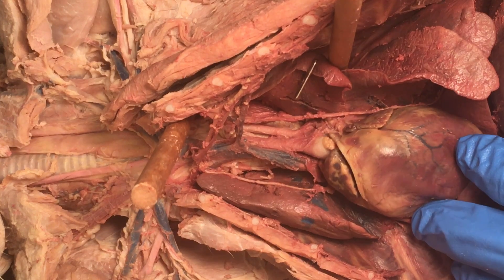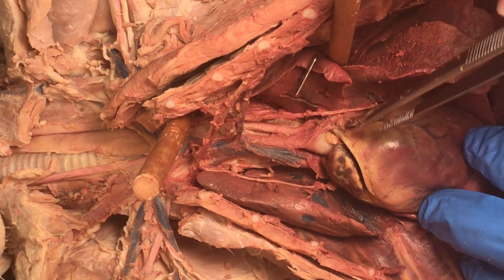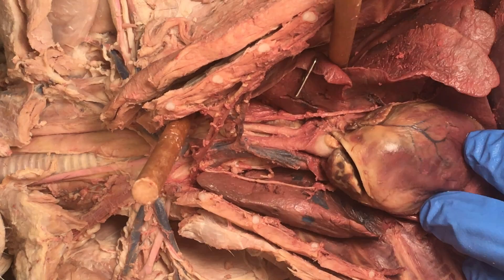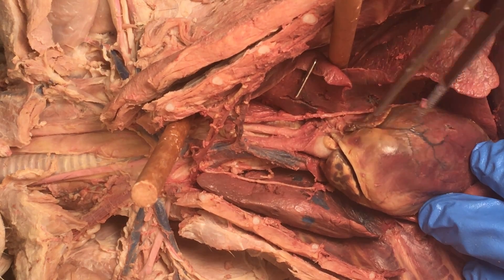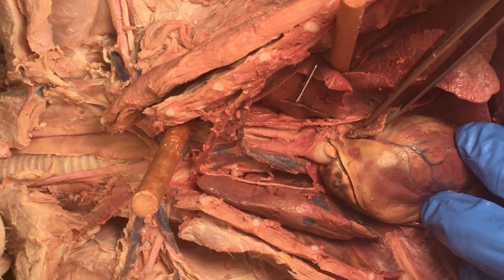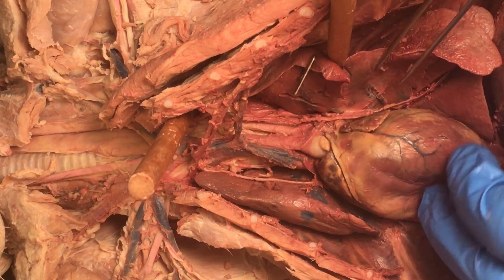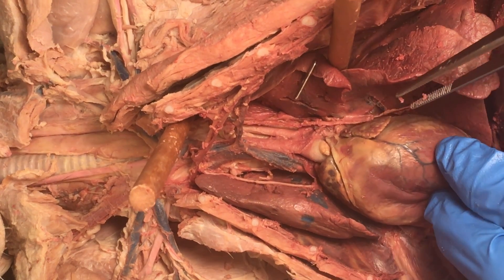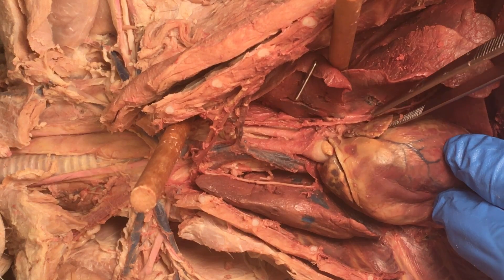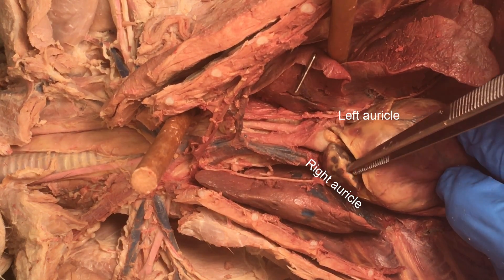You can see these flappy structures. We saw these in the pig heart, and those are auricles. Those auricles are part of the atria, and we're dealing with the cat's left and right, just like a patient. So this is the left auricle, and that's the right auricle.